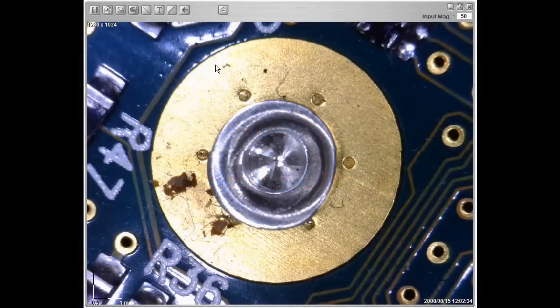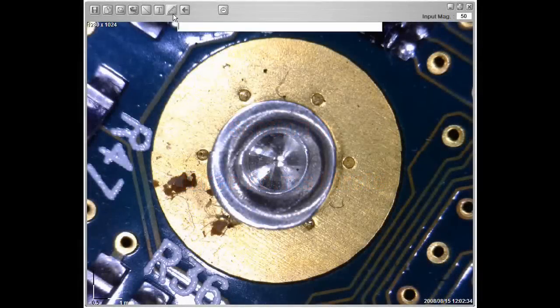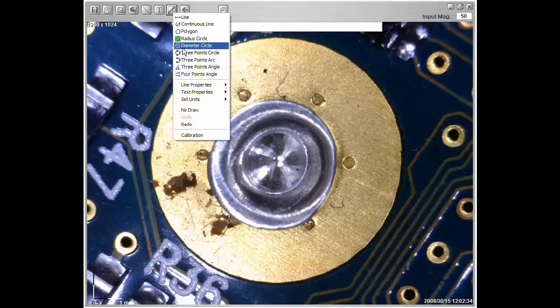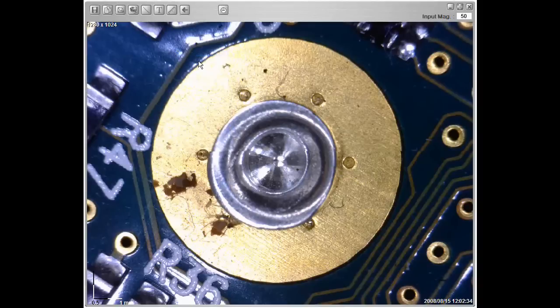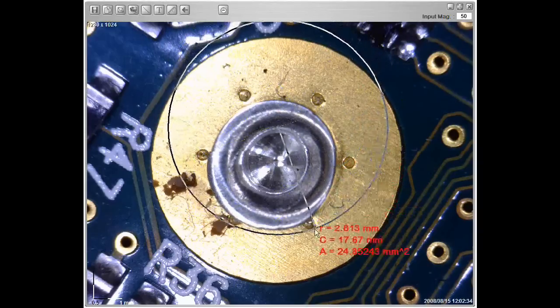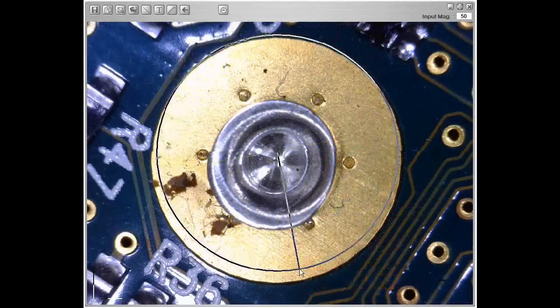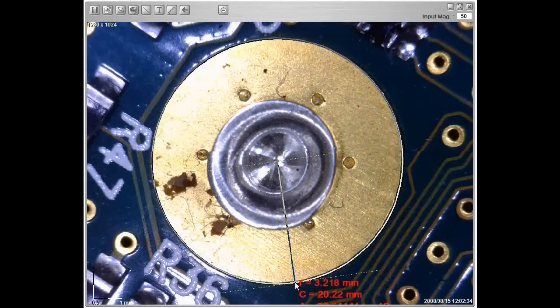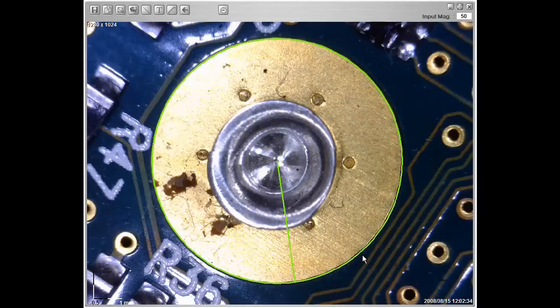Select three points circle to measure a circle by selecting three points from the perimeter of a circle. Start by left clicking on one point of the circle, select another point, and end the measurement with the third point. Now place the results where you would like it.